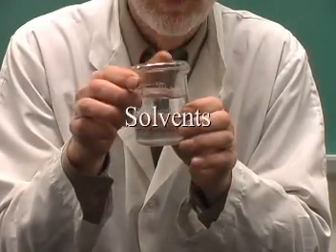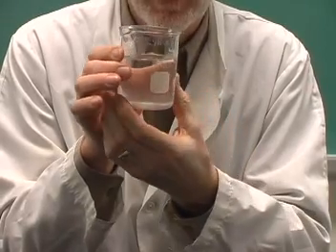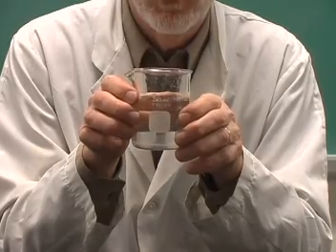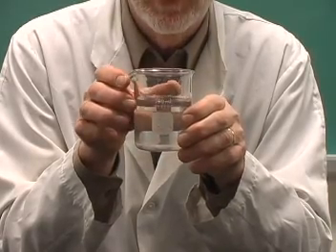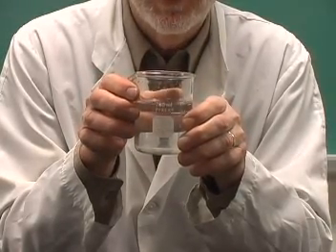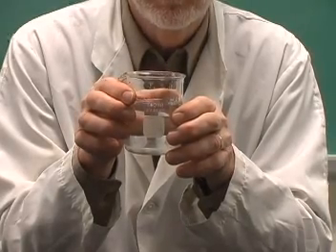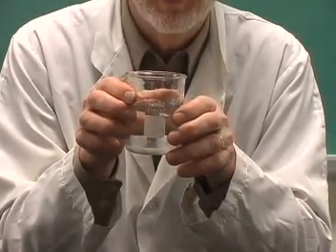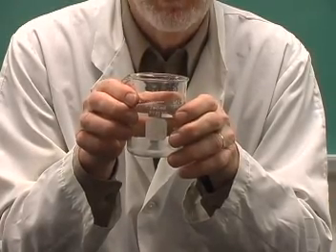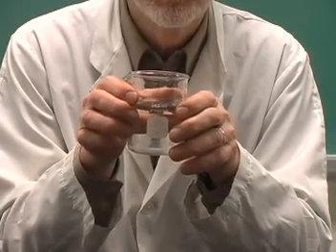The most common solvent that we use is, of course, water. I would recommend that you use a form of purified water rather than just tap water for most of the experiments, simply because some of the impurities in the water can interact with what it is that you're doing. You can buy distilled water. You can also obtain deionized water or reverse osmosis water. Any of those purified forms of water would be quite suitable for the elementary science experiments.